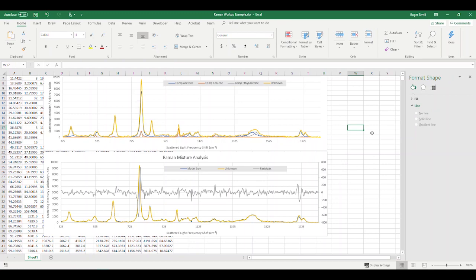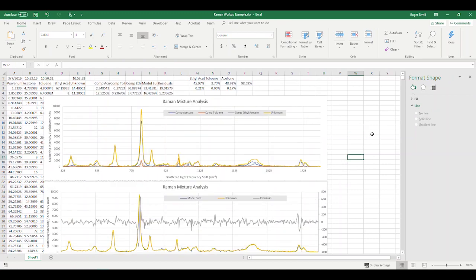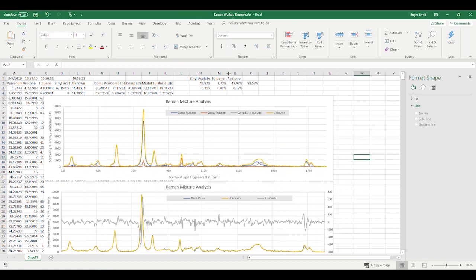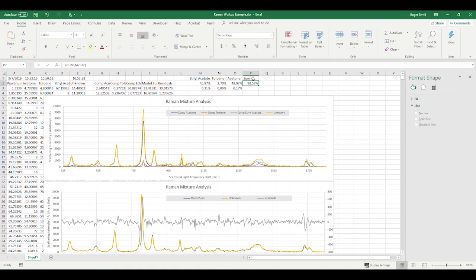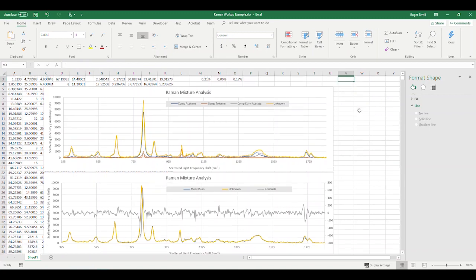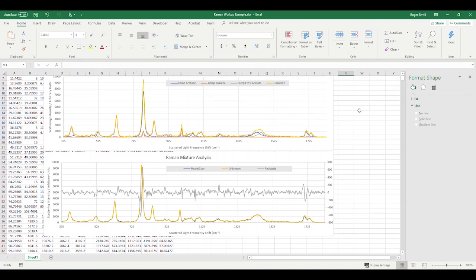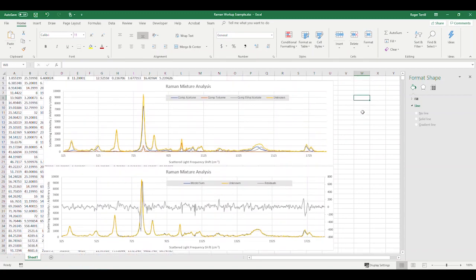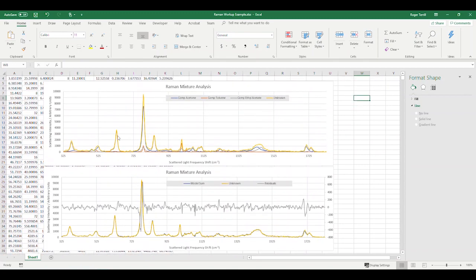So here is the report. Ethyl acetate, toluene, acetone. And this is the sum of these guys. And this is what we want from the analysis. We want 45, 3, and 48 percents there. And that is all we need to do here for the basic data analysis.